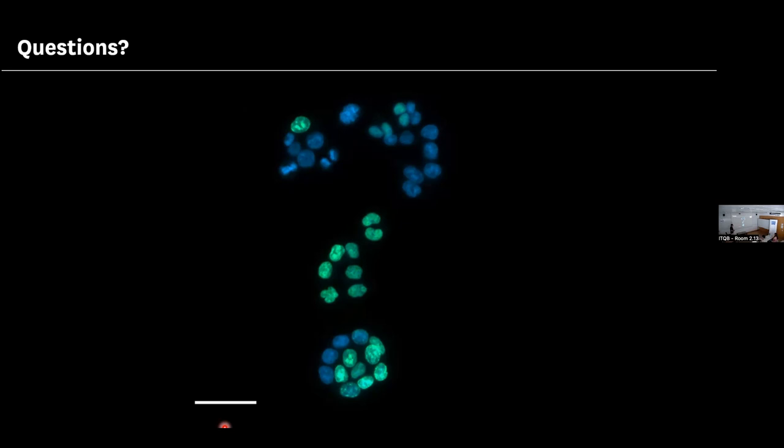No, perfectly clear. Not really. You can use the same fluorophore. The wavelength that you use to excite them is not necessarily the sum of the wavelengths of the peak excitation of the single photon excitation spectrum. It doesn't really work like that. The excitation spectrum of multiphoton is somewhat complex. So if you have a fluorophore that has a peak at 500 nanometers excitation, it doesn't mean that you are going to use 1,000 nanometers excitation in multiphoton. It could be 920 or 850. It's not really linear.